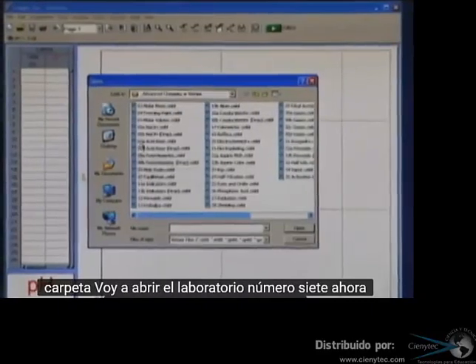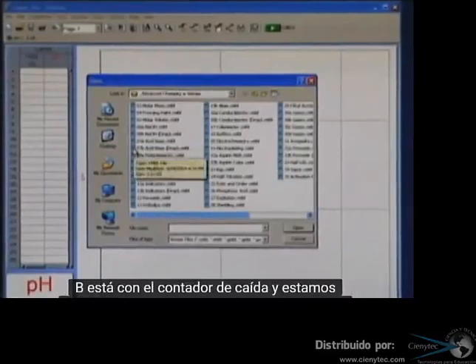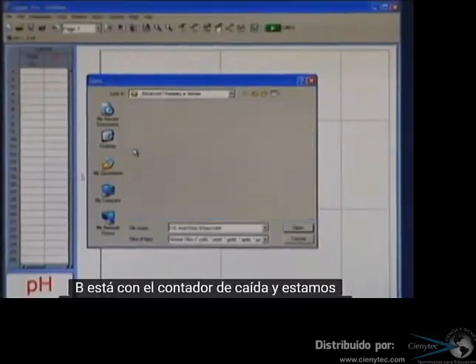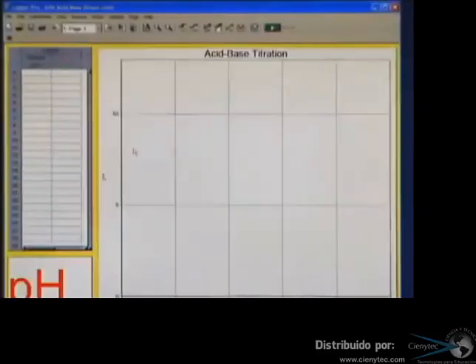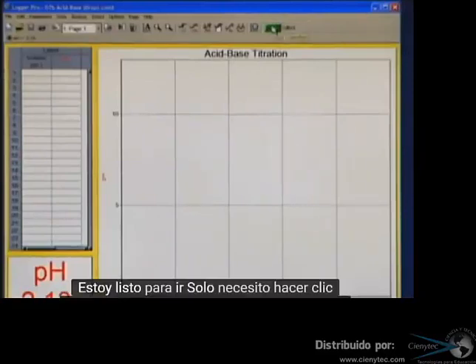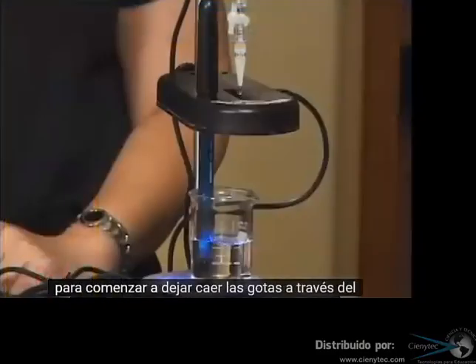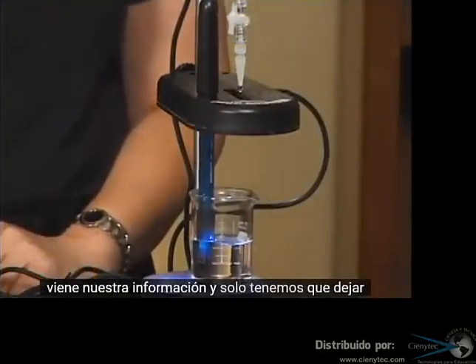Now there's A and B. A is with a burette and B is with the drop counter, and we're using the drop counter, so I'll open 7B. I'm all ready to go. I just need to click on collect, and now it's waiting for me to start dropping the drops through the drop counter, and here they come. So here comes our data, and we just need to let this progress as our titration proceeds.